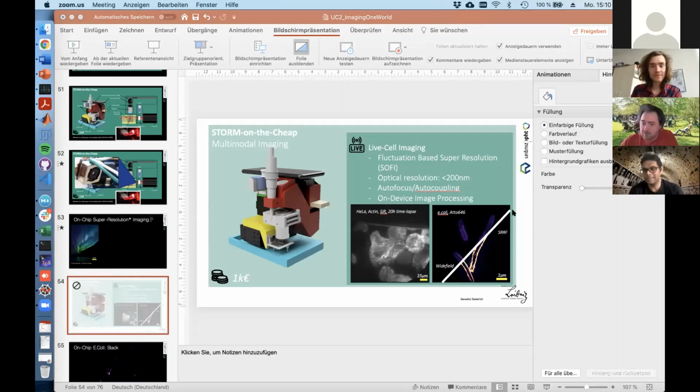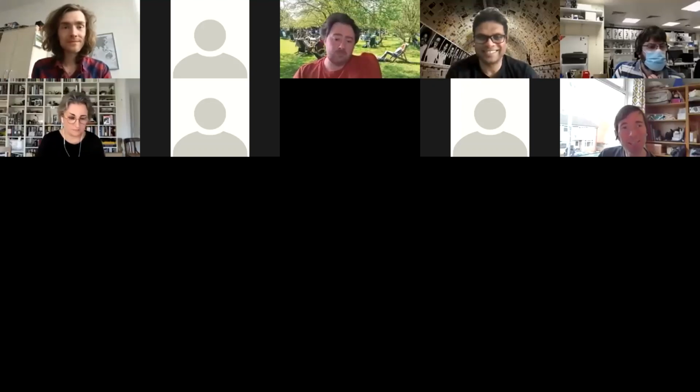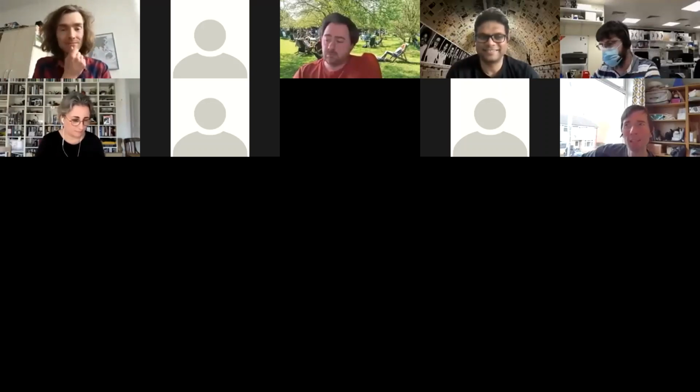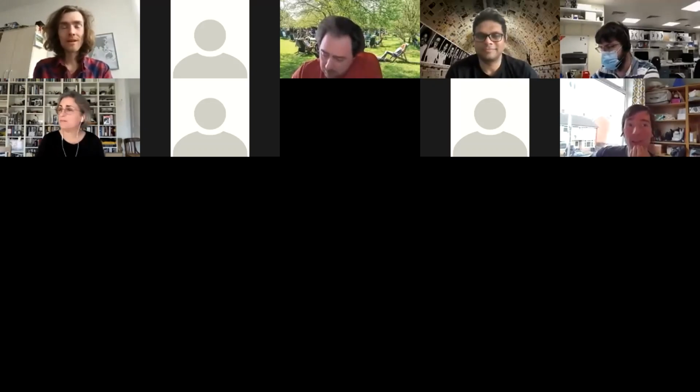Sure, thanks. I was curious during the quiz if Benedict's correct answer suggested that he was confident that UC2 assemblies were stable to better than a wavelength. I think 3D printed interferometers is something that I've played with a bit in my group, and we found it surprisingly hard to make it work. Not necessarily just statically sitting there and being stable to one wavelength, but being able to get any degree of controlled motion without your fringes just going all over the place is the really hard part. Yeah. I was just curious if you had experience of that.